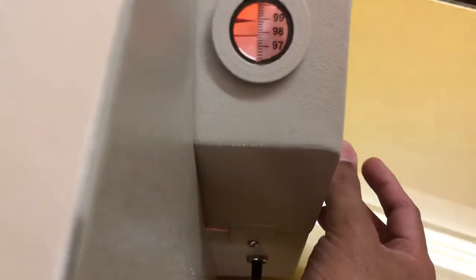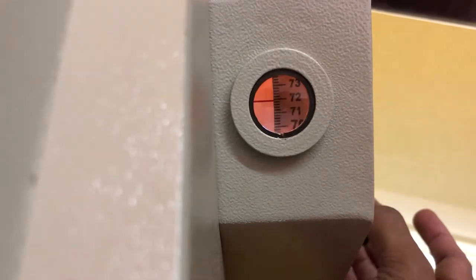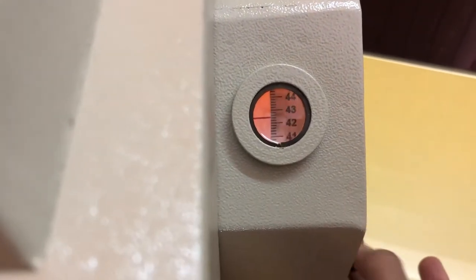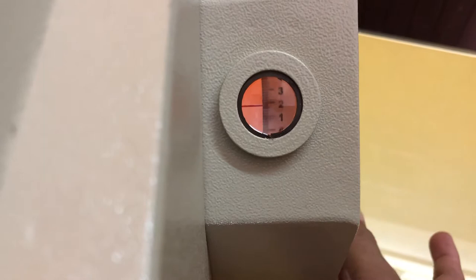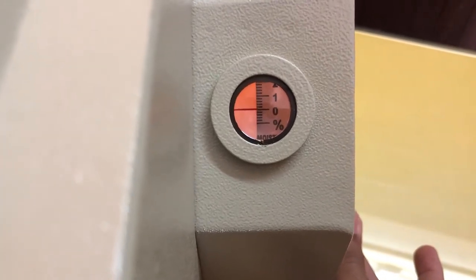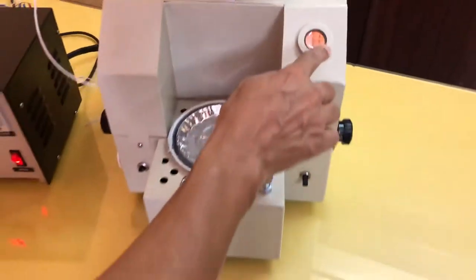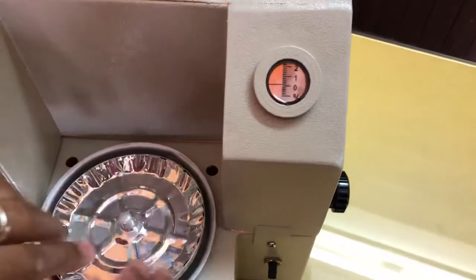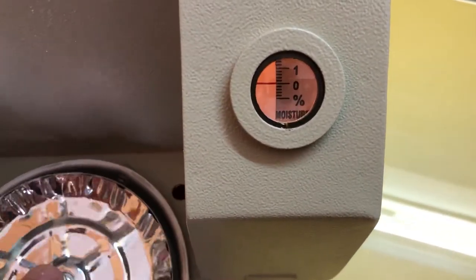In the third step, we will bring zero of the scale in front of the reference mark. In doing so, you will see that the pointer will go up — the pointer is somewhere upside. We will bring zero. One thing you have to take notice: you have to rotate this knob gradually, slowly. Now this is the zero of the scale. The pointer is above the reference mark. When we press this sample pan, you will see that the pointer is coming down.